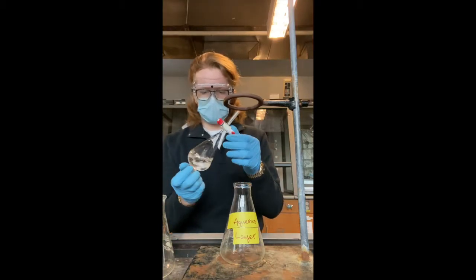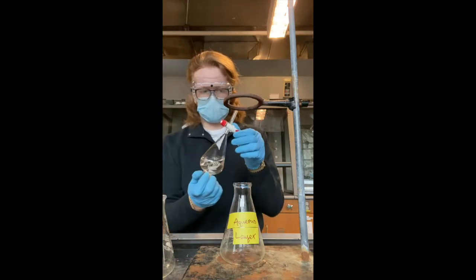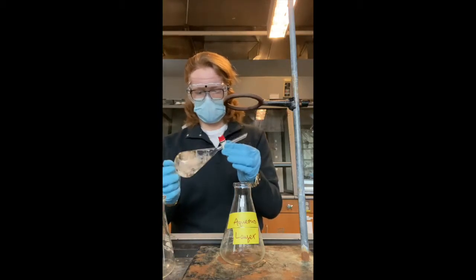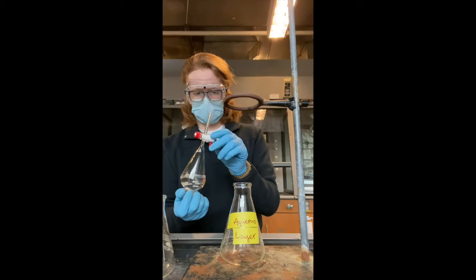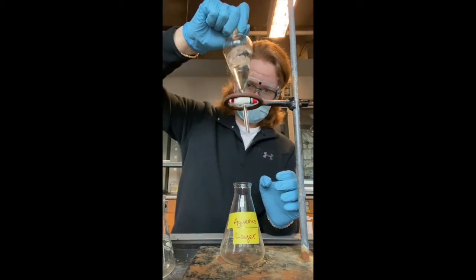Then you will shake up the separatory funnel to mix the solvent hexane with the mixture of distilled water and benzophenone. You will then open the stopcock once again to release any pressure and close it before mixing again. You will complete this process a total of 3 times, as I have just done.